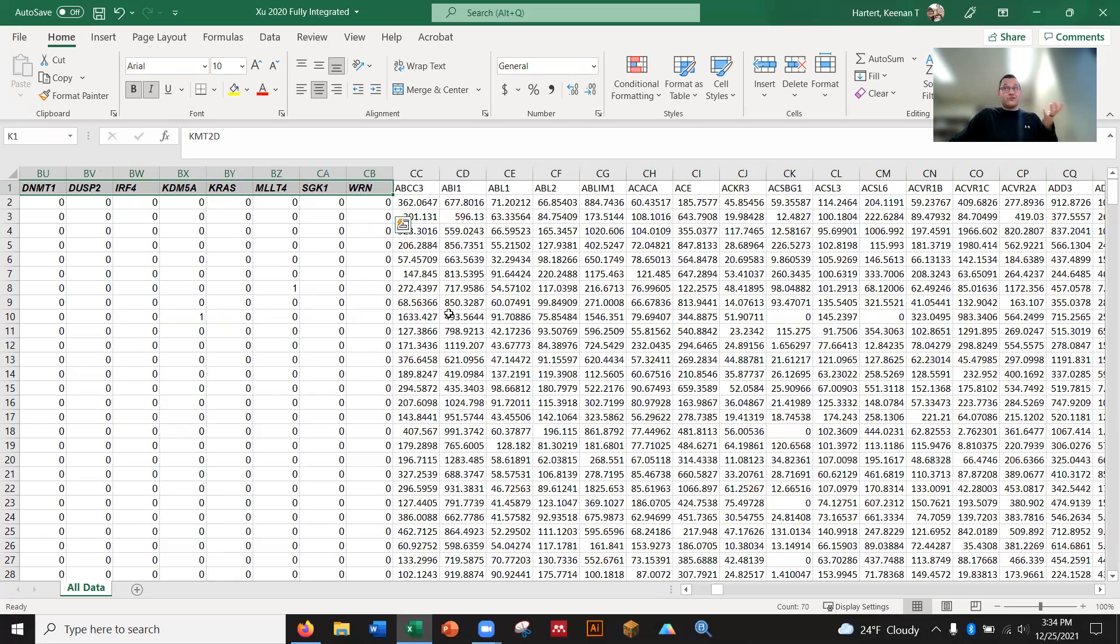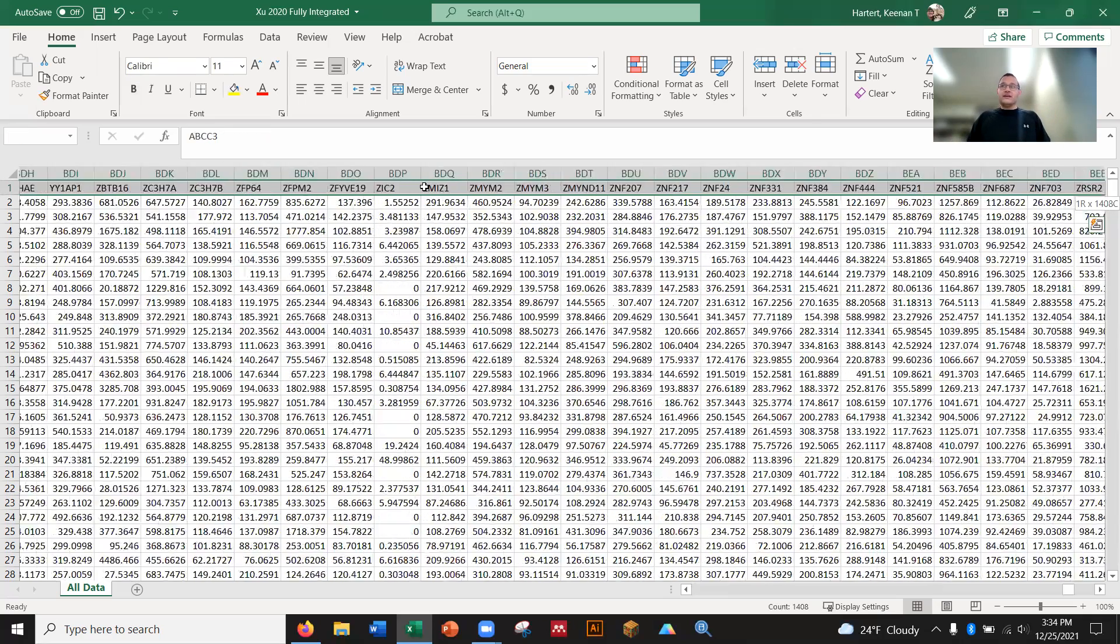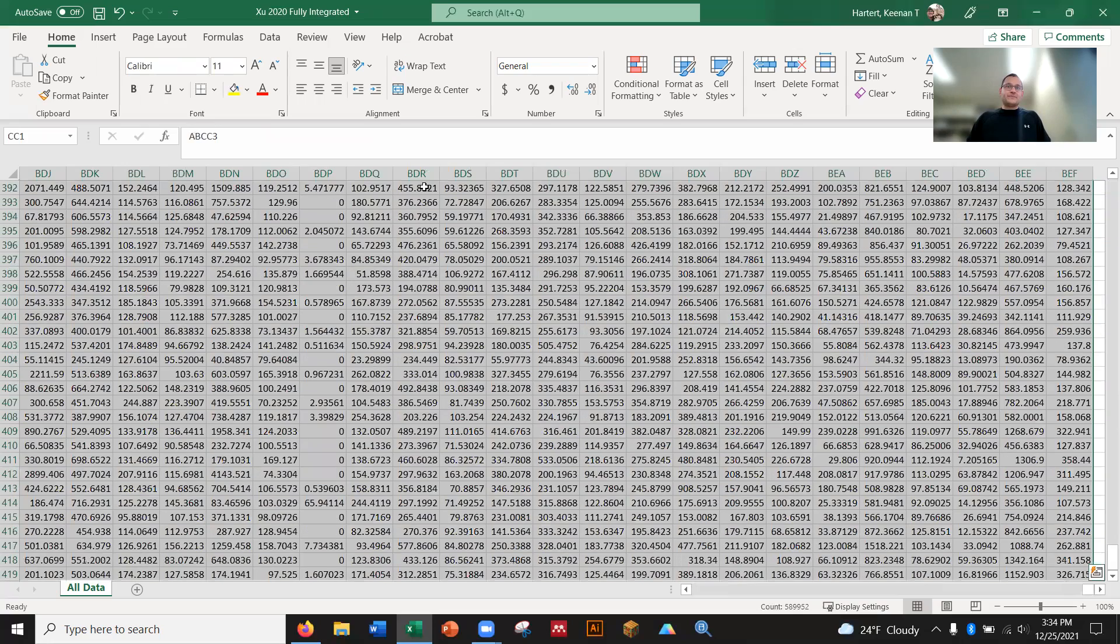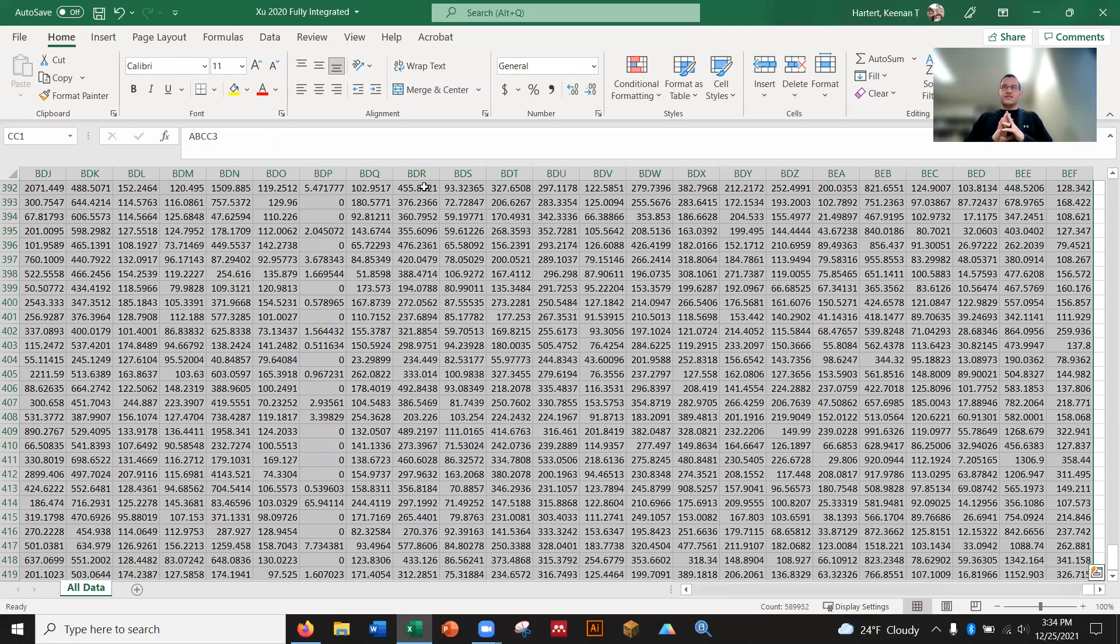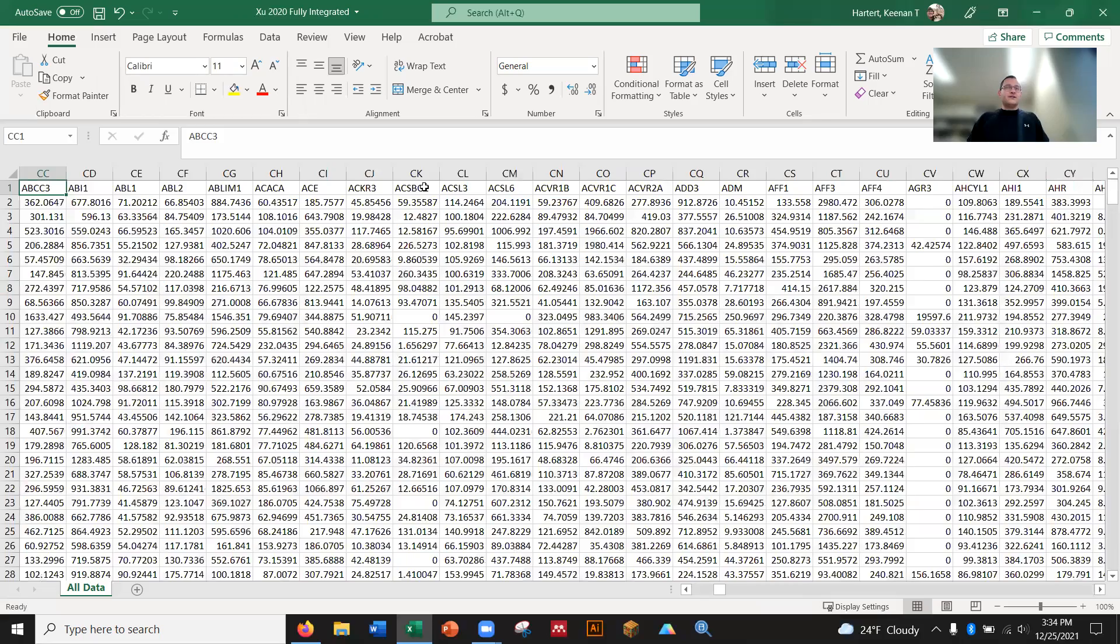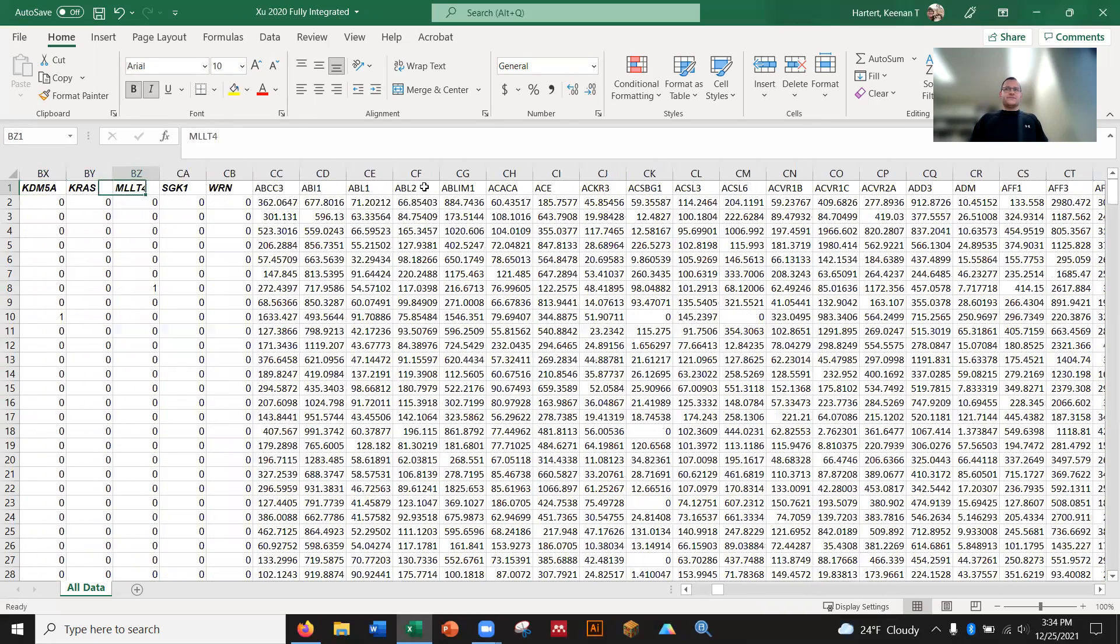Now remember DNA mutations, they're there or they're not there. It's not quite always as simple as that because tumors are very heterogeneous things, but this is the best tool we got, right? Now back to our RNA over here, sequenced 1400 genes for their RNA expression, that up and down level. So everything in here, there's three factors in this sheet that are fully integrated. It's clinical, DNA, RNA.